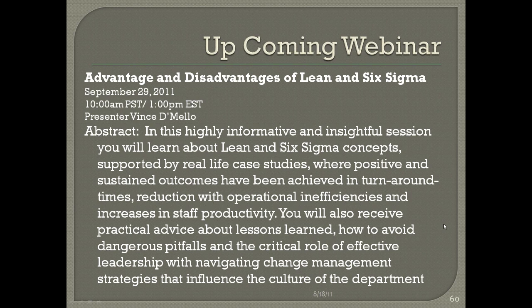Thank you. The next question is, how do you handle sections too thick and underprocessed? Can they be reprocessed? Like with your old conventional processor, of course you can reprocess it, but what you really need to do is to make sure that the specimen you put on before reprocessing is at the right size.